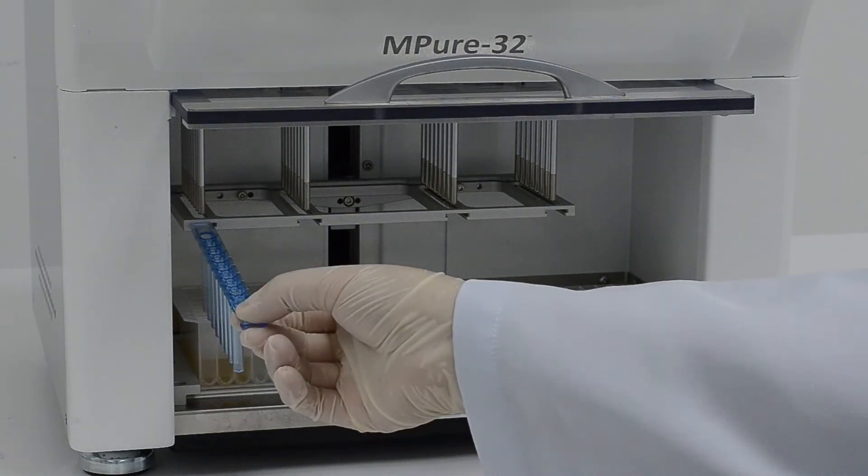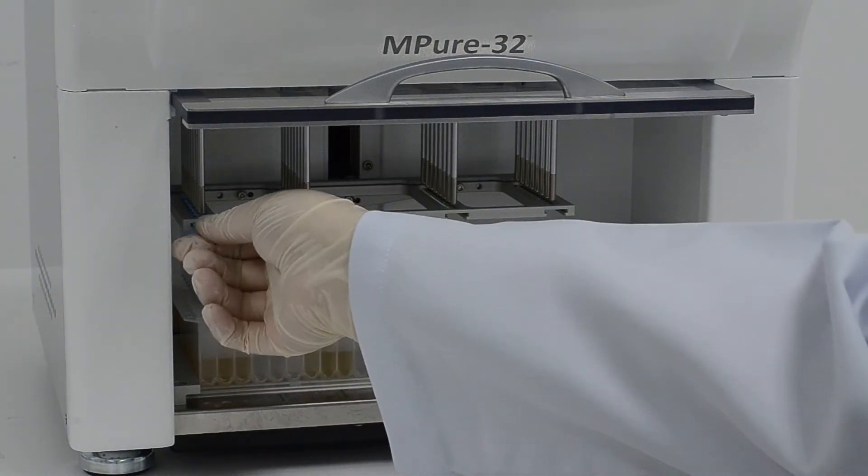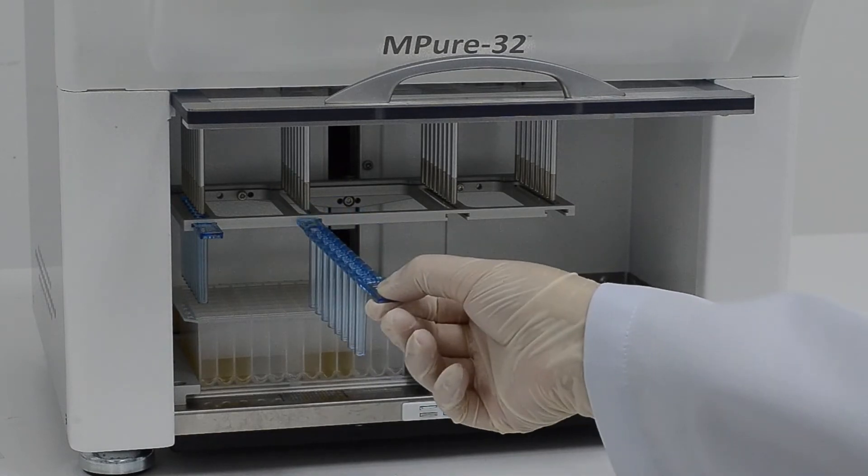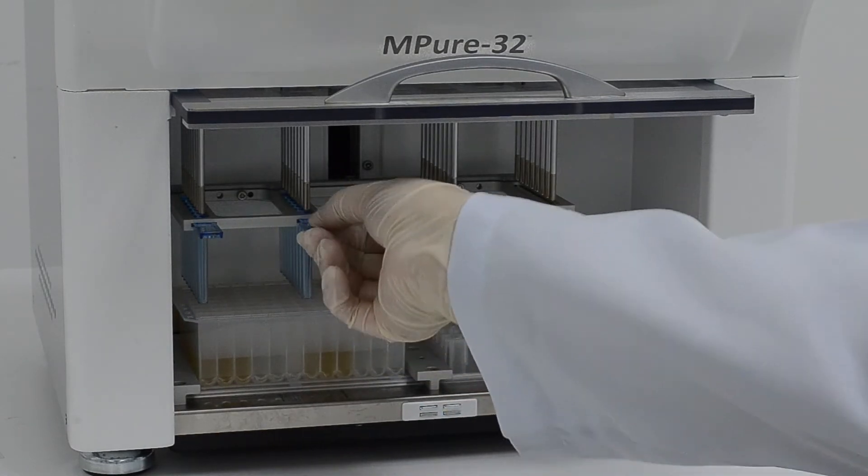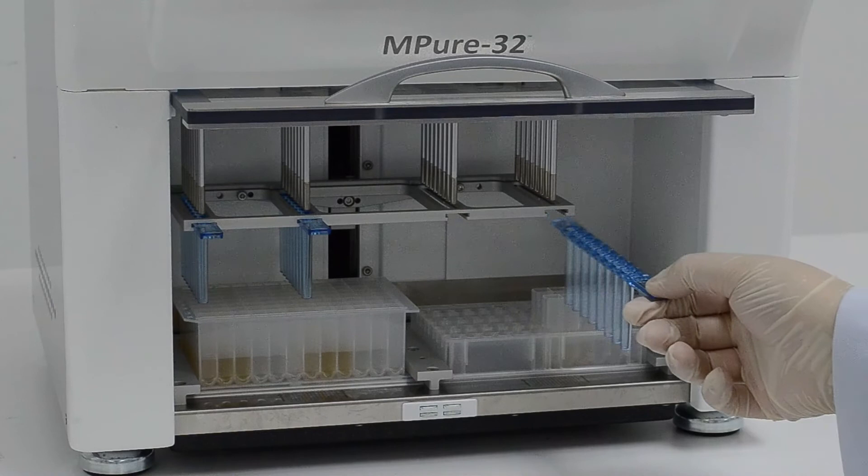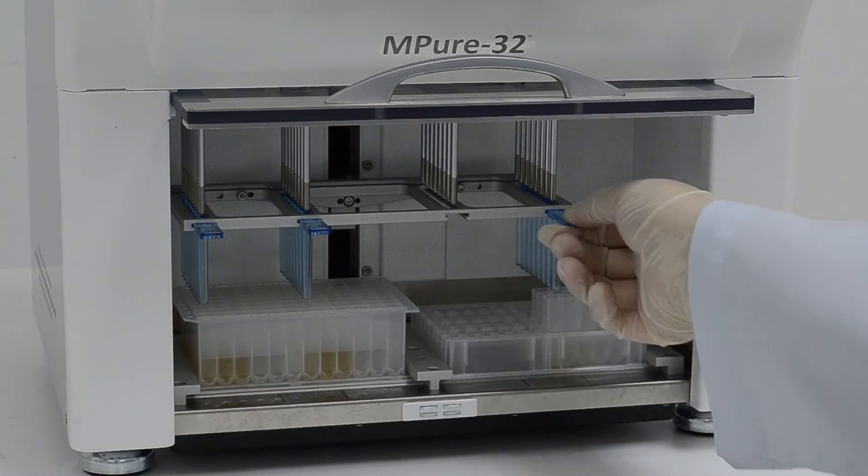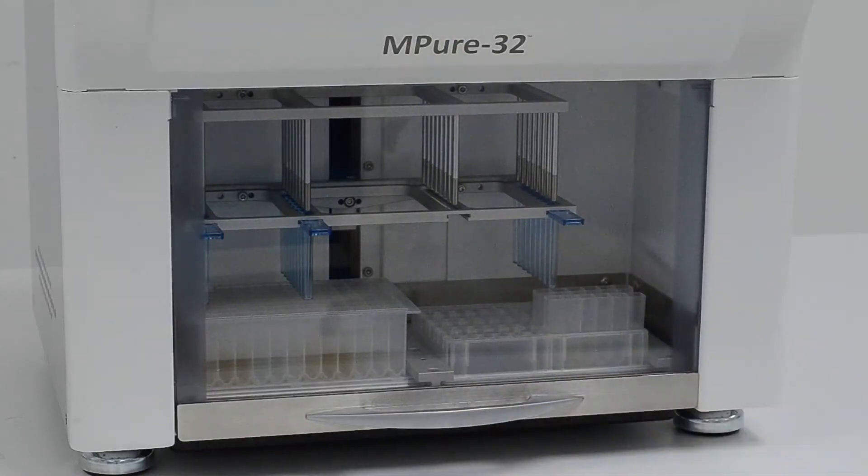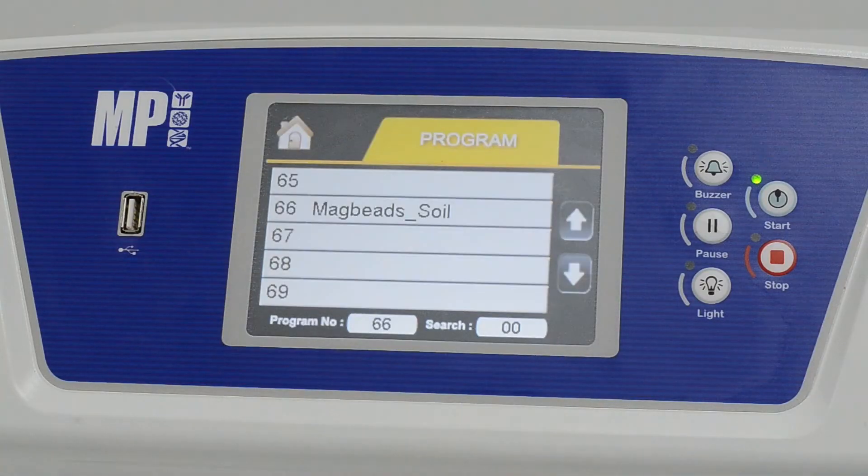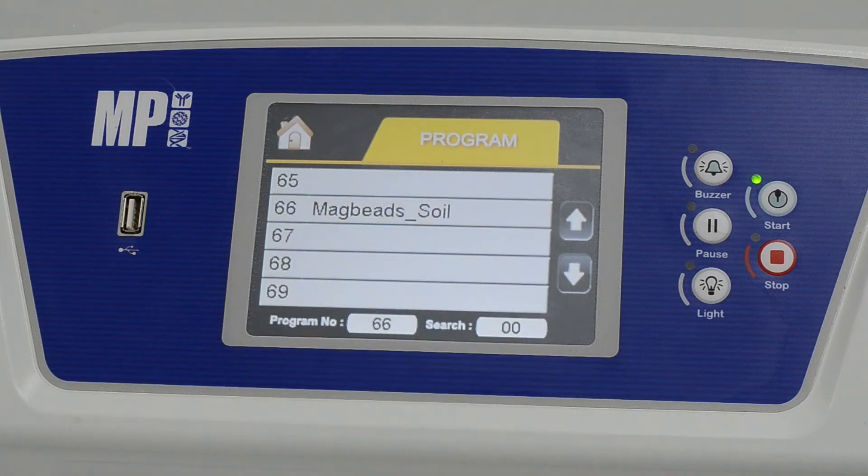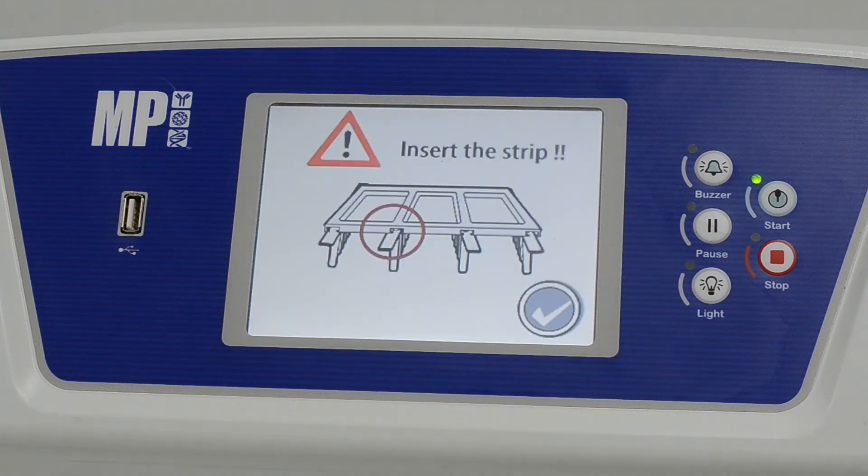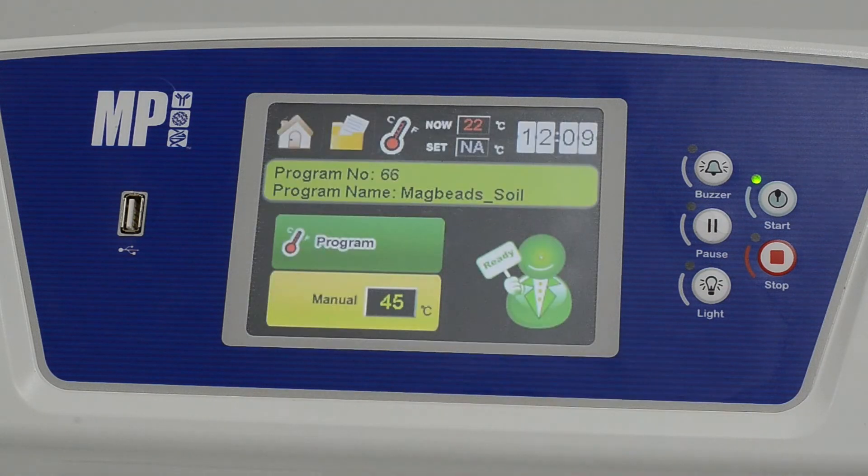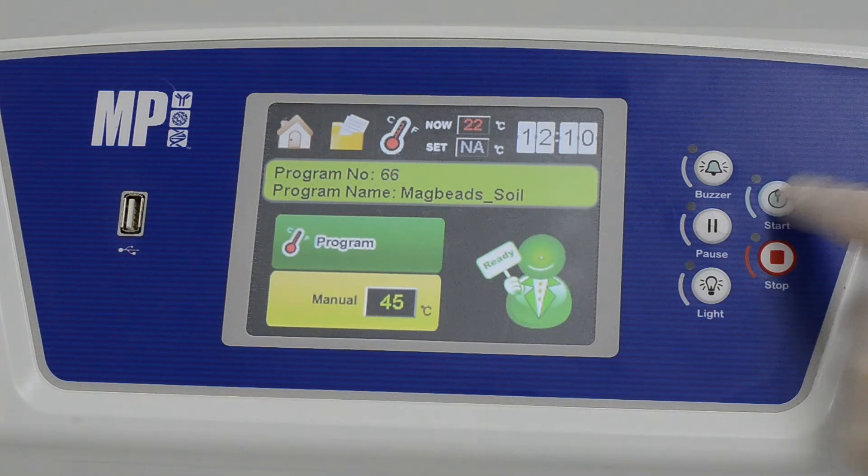Install the strips as per required. Press on program. Scroll to Magbeads Soil. Press on the tick to confirm. Click on start.